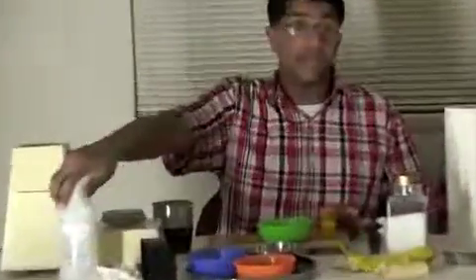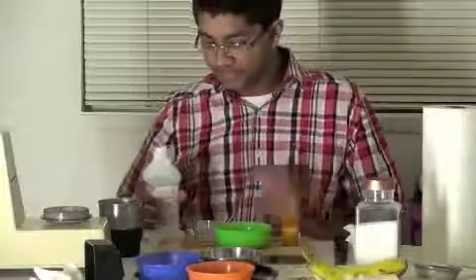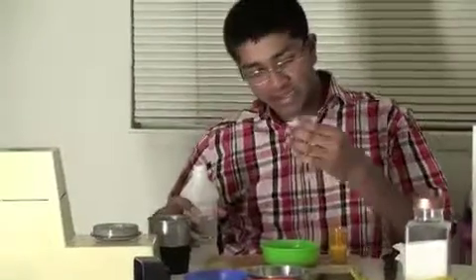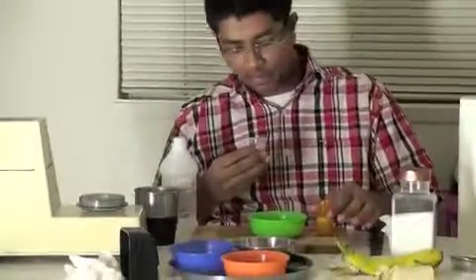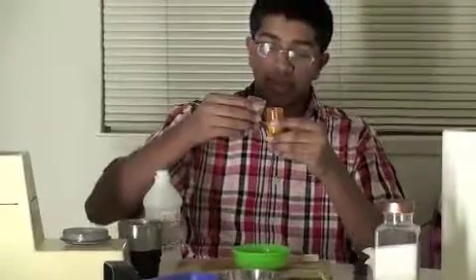Now for the alcohol. Remember, this is a very complicated step, though it may not seem so. Alcohol is pretty dangerous. This is 91% alcohol, so it's pretty strong. And all of those people who just can't wait till they're 21, try to restrain yourself here. So we're going to put about the amount that's already in here of alcohol into this. Okay, so we put, as Aditya said, 5 milliliters. So there, poured it in. It's good.